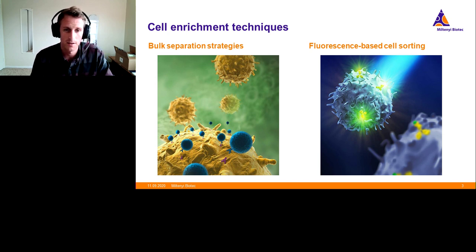Historically, something like fluorescence-based cell sorting or flow cytometry sorting hasn't afforded that luxury. These are usually done in an open environment, something that requires the cells to be passed through the air to be sorted effectively. And really, of all the flow-based sorters that are in the field currently, it's got to be in the high 90% of instruments that are using this type of technology.